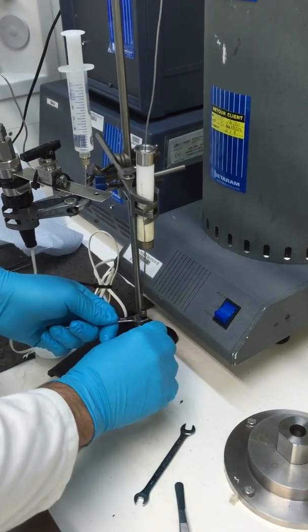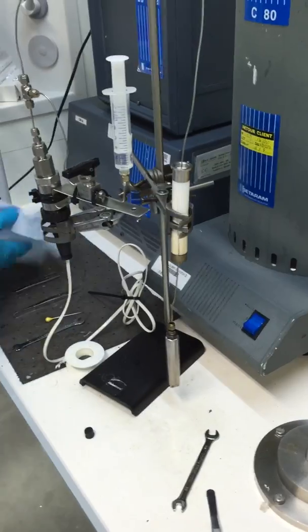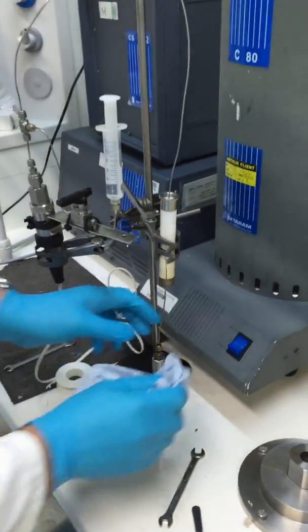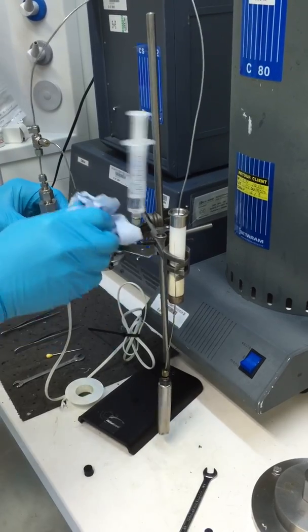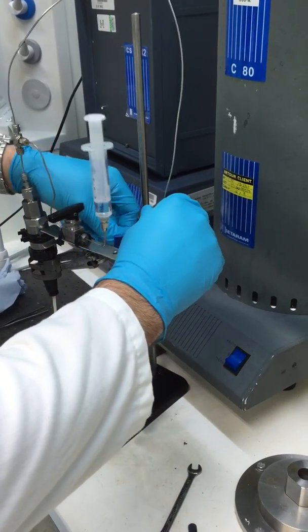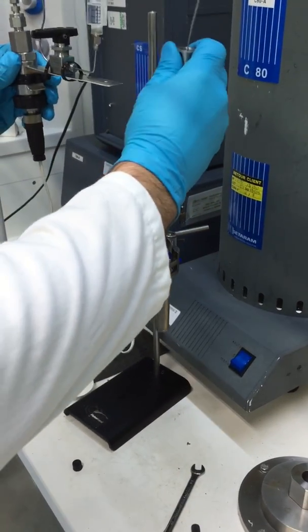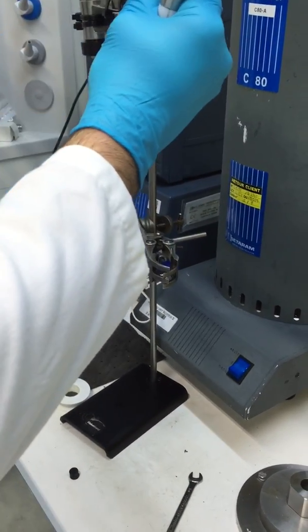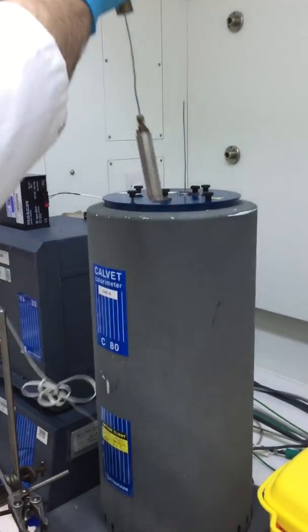Once that is at the required tightness, the pressure transducer and spacer is removed from the jig and then placed in the top of the C80.